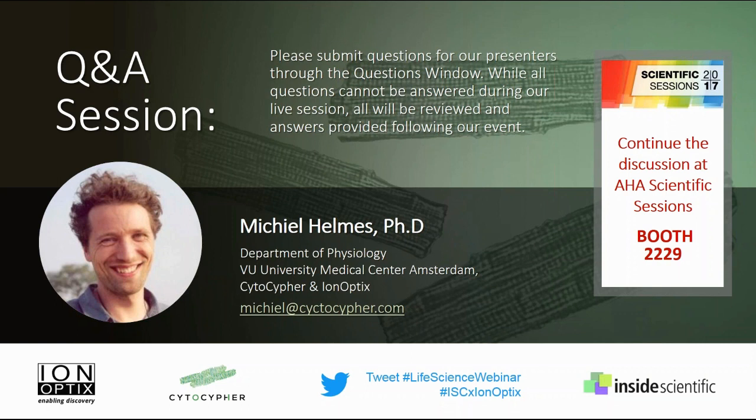I'm hesitant to say animals. I know that the company in San Diego, Abayas, is now doing it with human myocytes that they acquire on a very regular basis. So we're actually dealing with it this year because we got them a system to do this. You still need to do it on a number of preparations, but each day that you have a preparation, you can test a large number of compounds and repeat the same compounds the next day. So we try to facilitate as much as possible. You can measure small batches, say 50 cells in a well, and then move on to the next well that has a different concentration or a different compound. So you can look at cardiac toxicity effects. I mean, we're a long way from being a true high throughput system where you can test thousands of compounds, but we can definitely move up in the chain of the way you test for it.